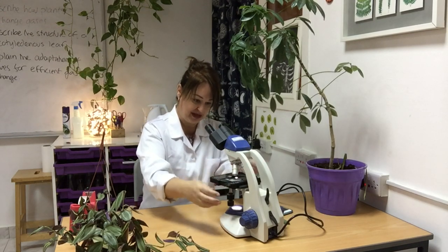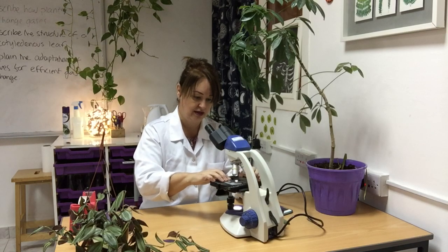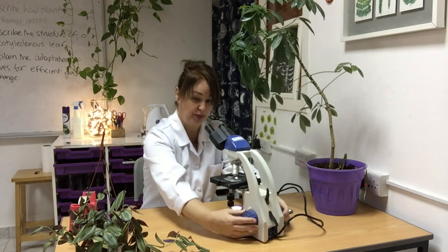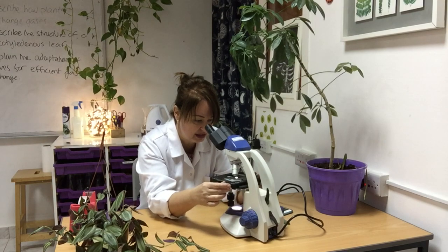Starting on our lowest magnification, pop the slide in, wind it up, look through it, and wind it away. At this point you might need to reposition it a little bit to find the stomata.